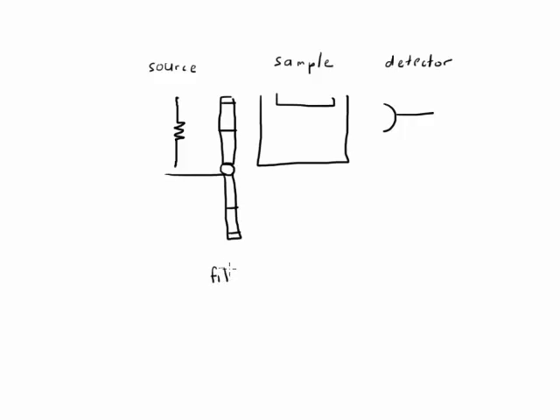That's called the filter wheel, and I'll draw another view of it so you get an idea of what it would look like. This is looking at the filter wheel head on, and there are little cartridges in the filter wheel that are filled with the gases of interest. One gets filled with nitrogen, and that's actually how we do the measurement for this analyzer, and the other gets filled with the gas we're trying to analyze.